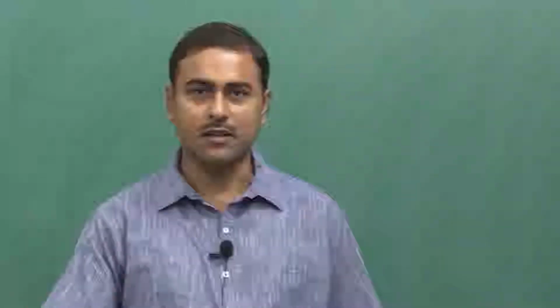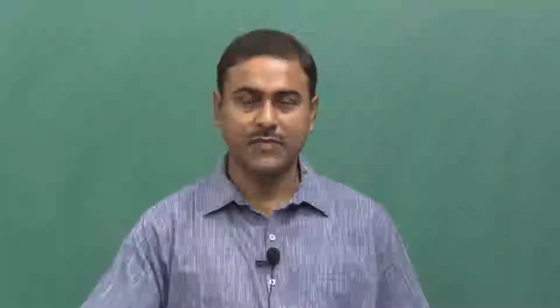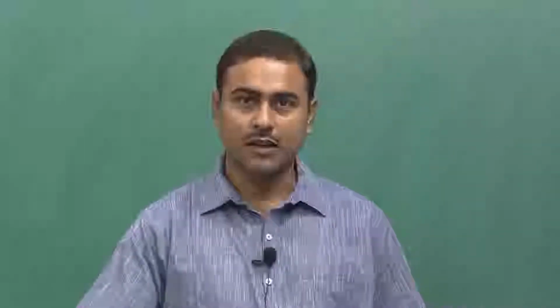Welcome to lecture number 39. Till the last lecture, what we have done is the importance of single molecule spectroscopy, right? And we have shown what kind of extra information single molecule spectroscopy can give. We also have seen that a small observation volume is essential to get the information of a single molecule. So now the question is how to achieve such a small observation volume.